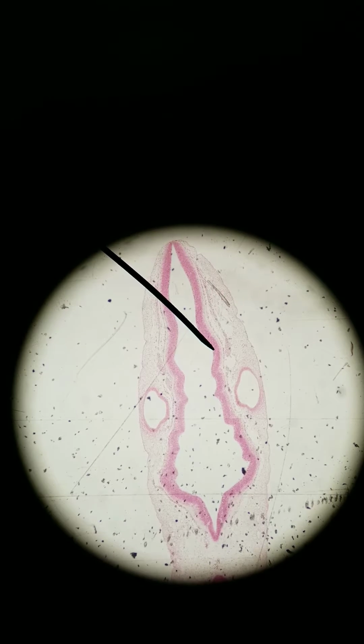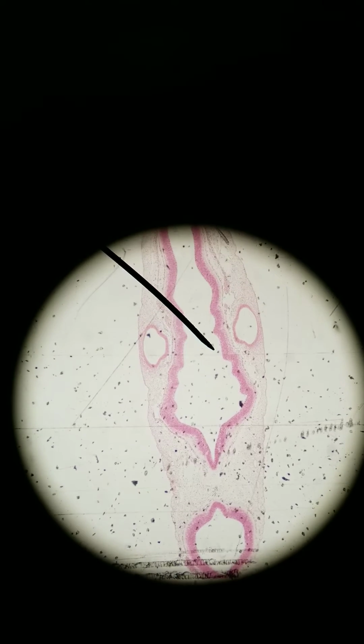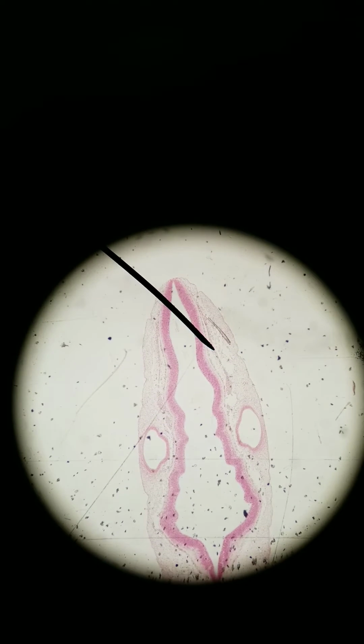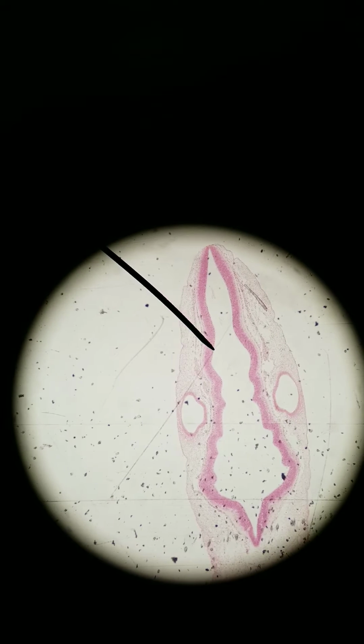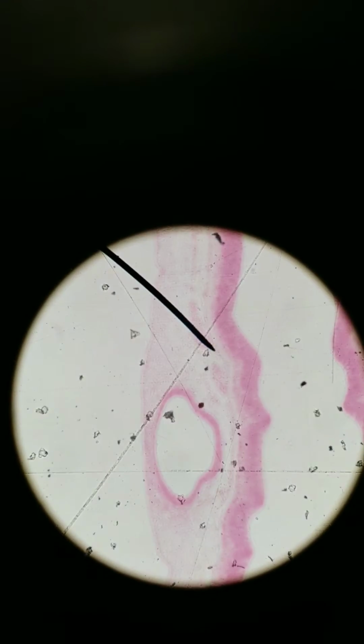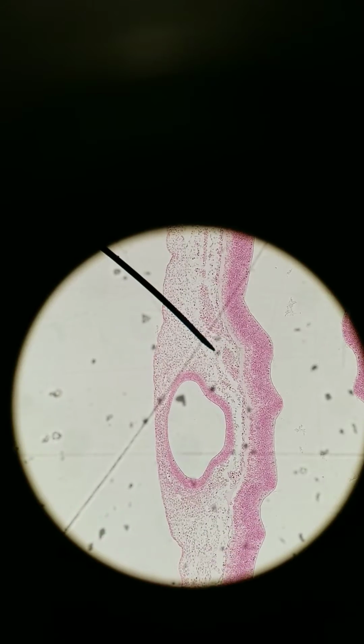We're going to be going over connective tissue histology. What we're looking at right now is a section of embryonic tissue. We're looking at the beginnings of mesenchyme, beginnings of connective tissue. That was at 40x total. I'm going to go to 100x total. We're going to get a bit closer.